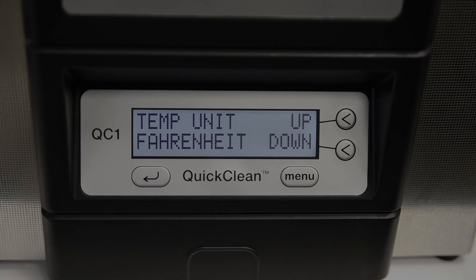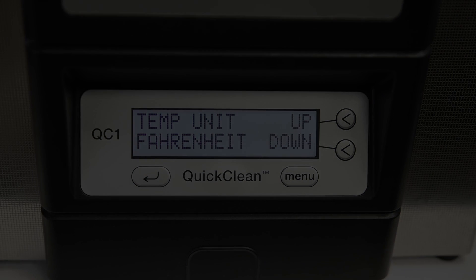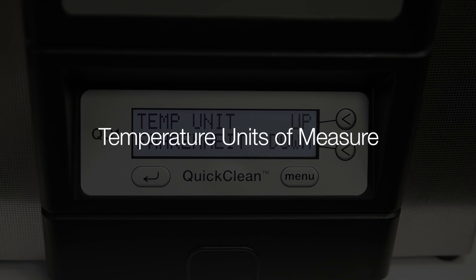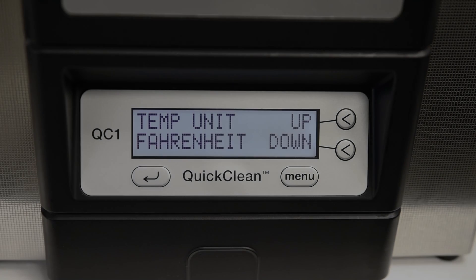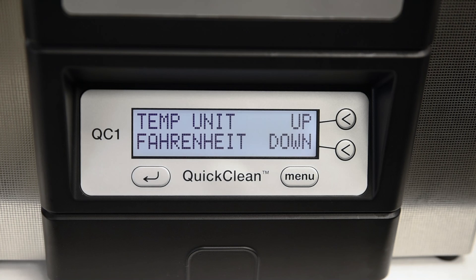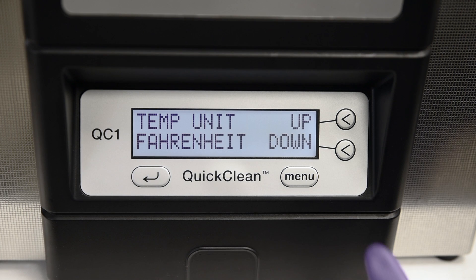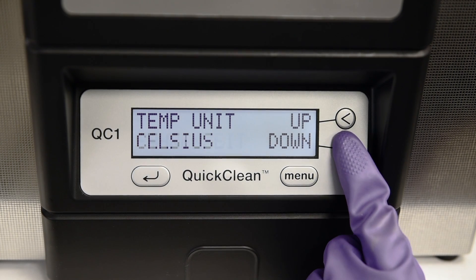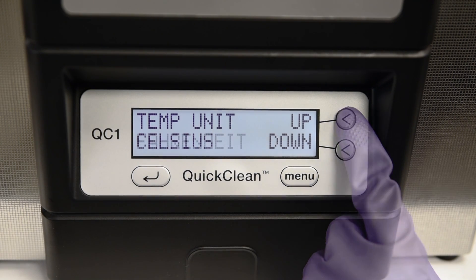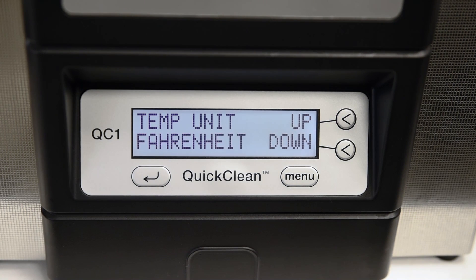The last setting option is setting the temperature units of measure. Your QuickClean has been factory set with the temperature units of measure of Fahrenheit. You can adjust this setting to reflect Fahrenheit or Celsius readings. Use the up-down keys to set the units of measure. When the desired setting has been selected, press the left arrow key to leave the menu setting options.